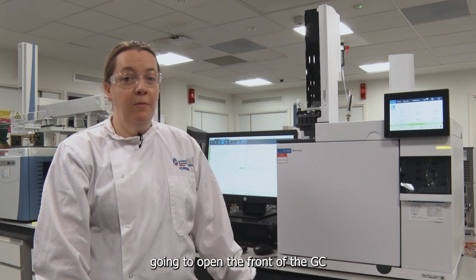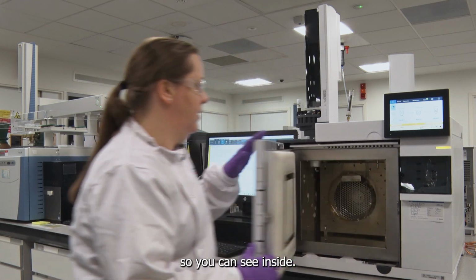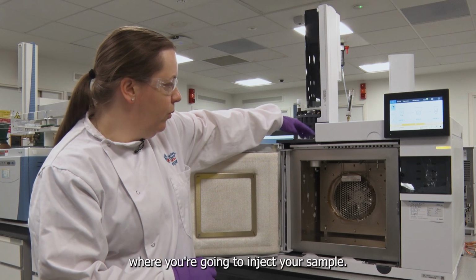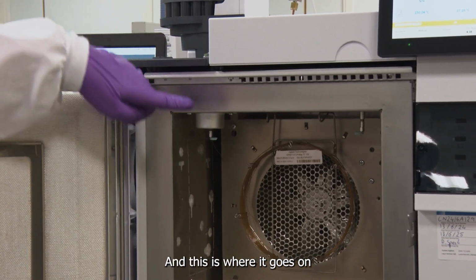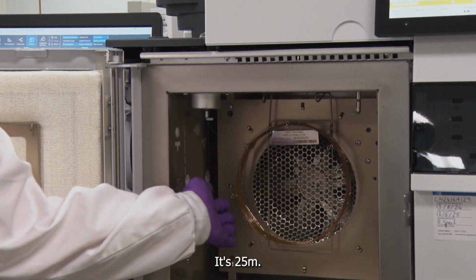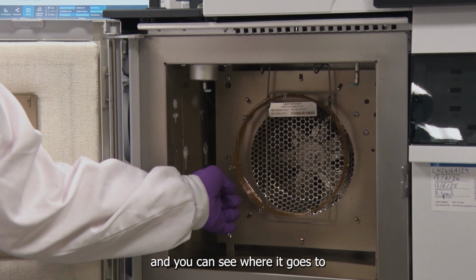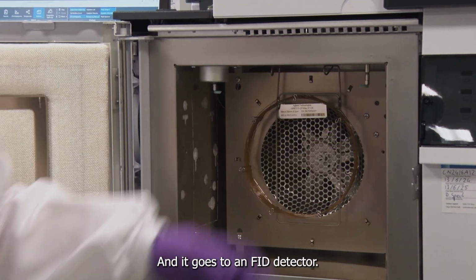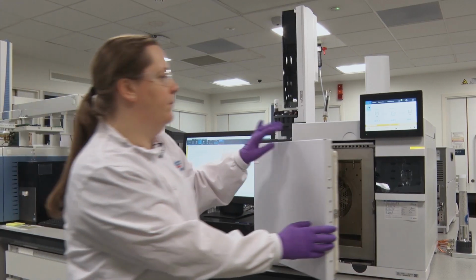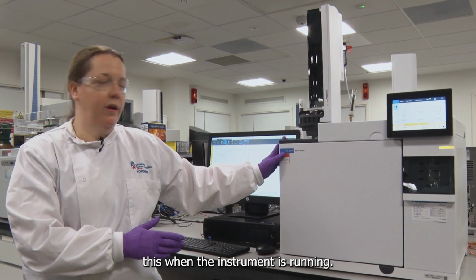To start off, I'm going to open the front of the GC so you can see inside. So we have the injector port where you're going to inject your sample, and this is where it goes onto the column. The column is quite long, it's 25 metres, so you can see that there, and you can see where it goes to the detector, and it goes to an FID detector. So I'm going to shut the front. And you can't open this when the instrument's running.